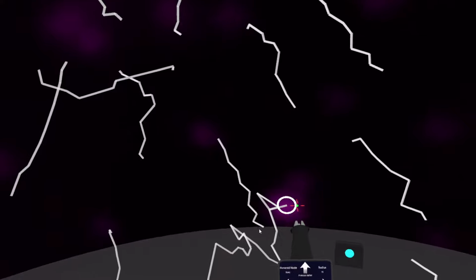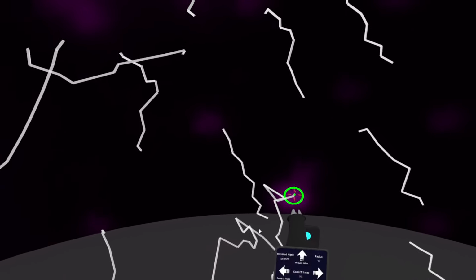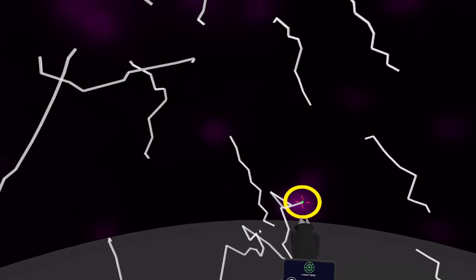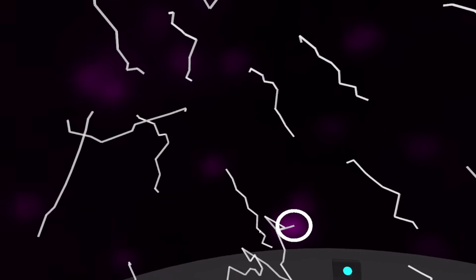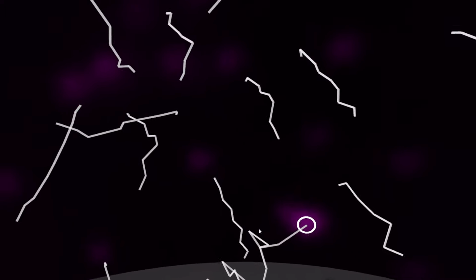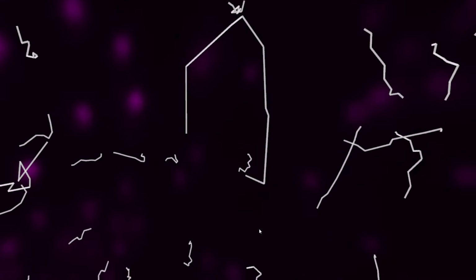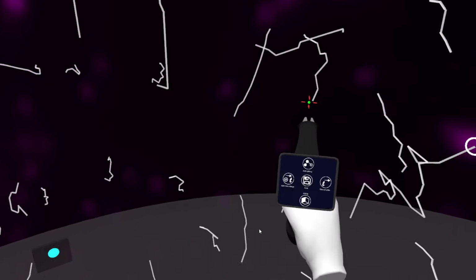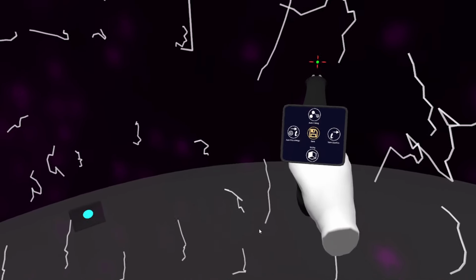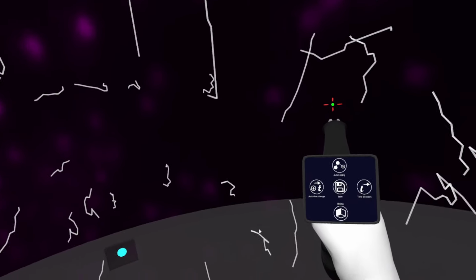And this one actually, well, the annotation, the circle is a bit tiny, and I would like it to be bigger compared to this. So I can grab it and then increase the radius until it's encompassing the whole cell at the right size. If this is important to you, you can just change the radius. Then finally, say I'm happy with this and I would like to save. I can go into the menu, and if I press in the center of the joystick, then I have the save button that goes into orange when it's saving, and then it's going to turn green when it's finished saving.